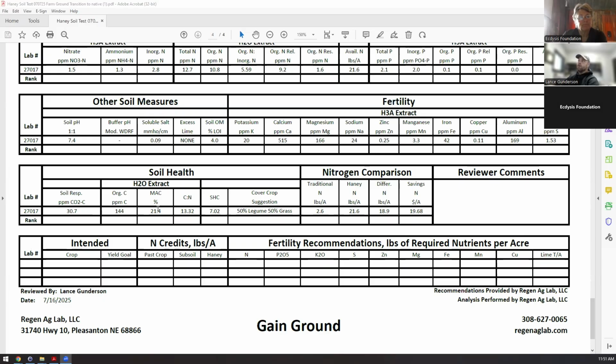But when we see total phosphorus around 2 parts per million, we start to see sulfur under 2. Something like a well-rounded compost or manure amendment again, and not much. We're not talking 25 tons to the acre. We've got to figure out what to do with all this feedlot manure. No, this is more like a half a ton to a ton of manure, and I'm talking 200 pounds of compost, something like that.